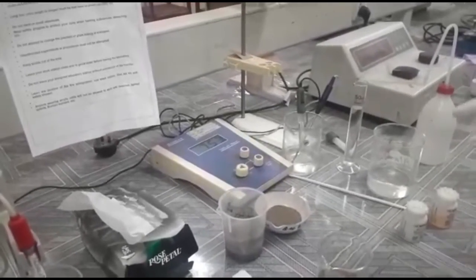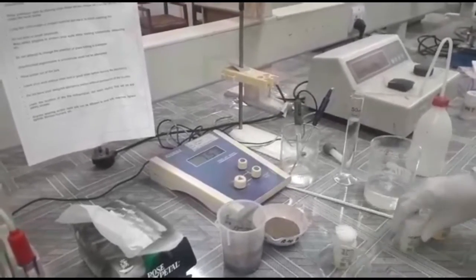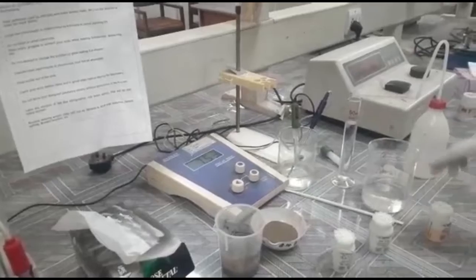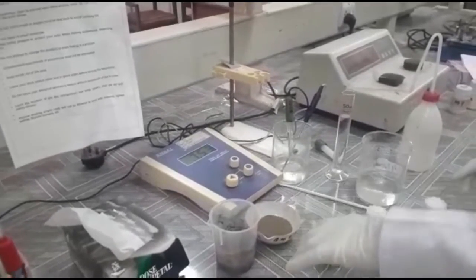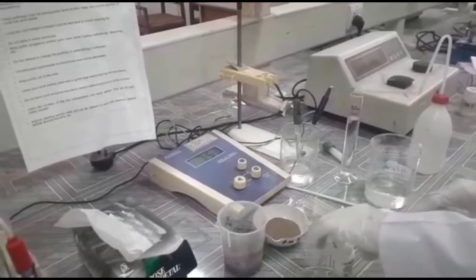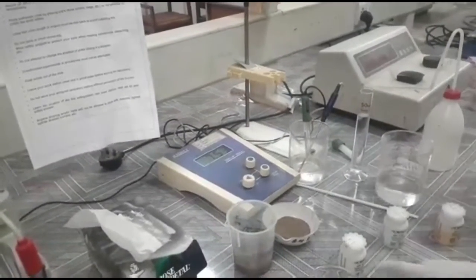To standardize the pH meter, first we need to have the buffers. We have a buffer of pH 4, a buffer of pH 7, and a buffer of pH 10.